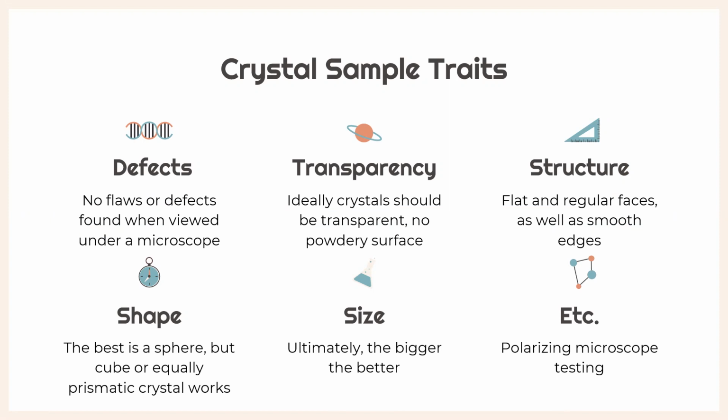If the crystal seems to be cloudy, have cracks, ingrown crystals inside, or growing out the side, then it should be discarded. Additionally, if there are multiple crystals stuck together or thin plate-like crystals stacked on top of each other, then they should not be used. Next, the overall crystal structure should be transparent and have polarizing capabilities. Additionally, crystals with a powdery surface should usually be rejected, but if the crystal is still translucent, it can be used if there are no better substitutes.